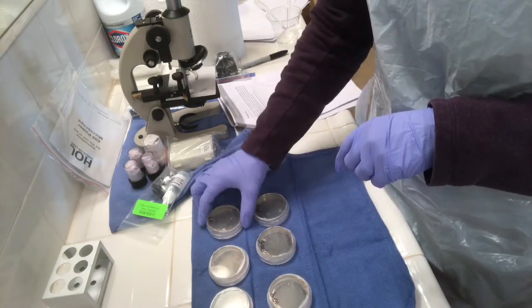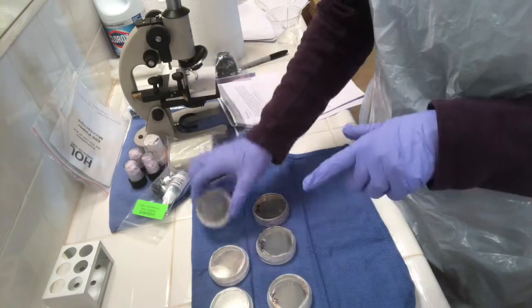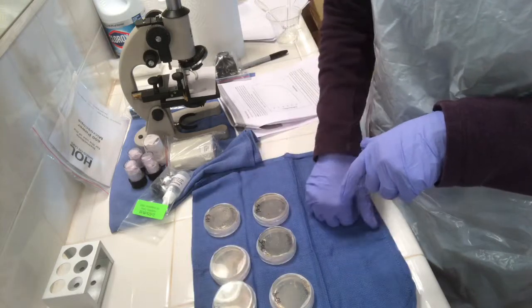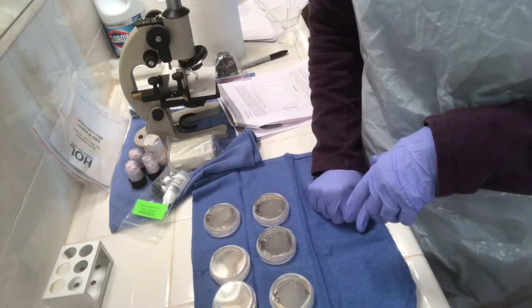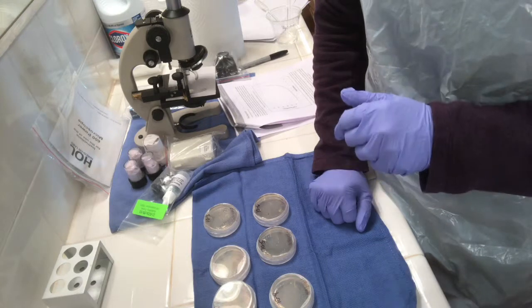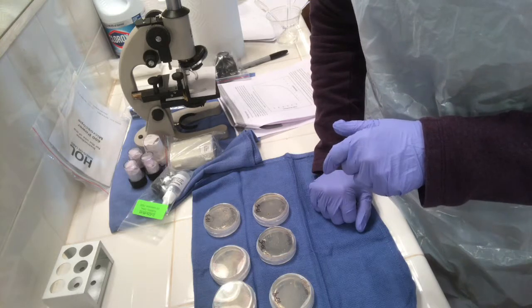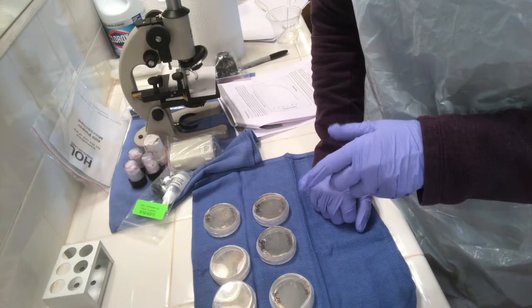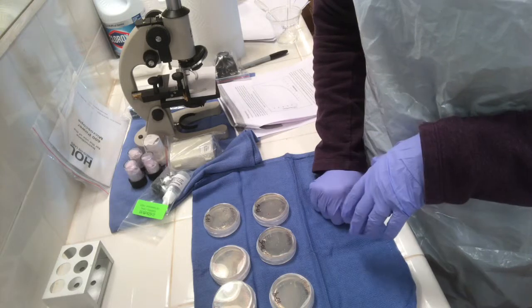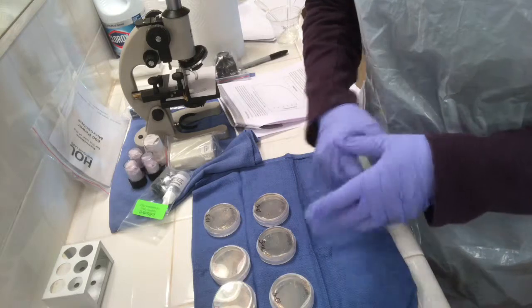So this is my video for what my incubated microbes turn out like. It did take an extra day because it's been cold here, and I didn't even think about temperature. Although I know we went over that in the first part of lab preparation, it didn't correlate. So for my next incubation lab, I will be paying better attention to the overall temperature of our environment.